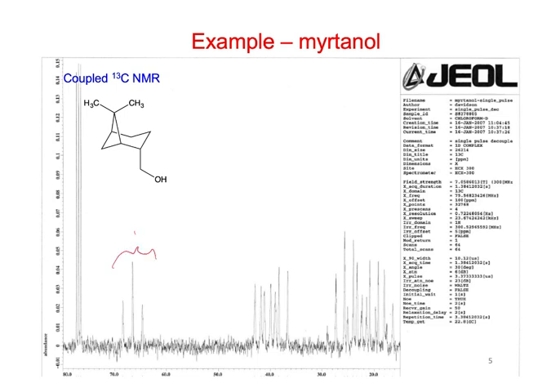For here was this CH2, right? So this is a CH2, so we see it as a triplet. Two hydrogens, N plus 1. Which hydrogens? Just the two that I put the arrow to. Right, because we knew that those are the furthest downfield, they're next to the oxygen.